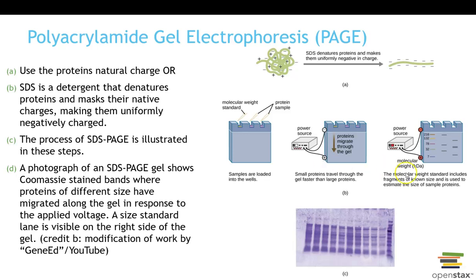And then again, we can run some ladder or marker, and by comparing to the ladder or marker, we can estimate the size of the protein and those bands that we get in that gel. So this is also a very useful technique for visualizing and separating proteins on a gel.